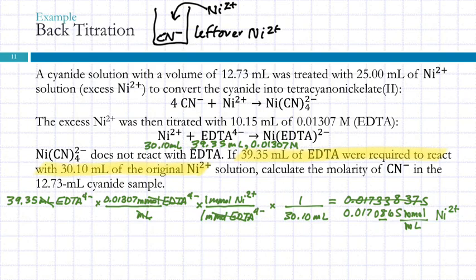And when you need to be extra sure that you got it right, or if you are working in a lab and making up a solution, they want you to write everything down. Because we had an incident happen where a solution was made incorrectly.